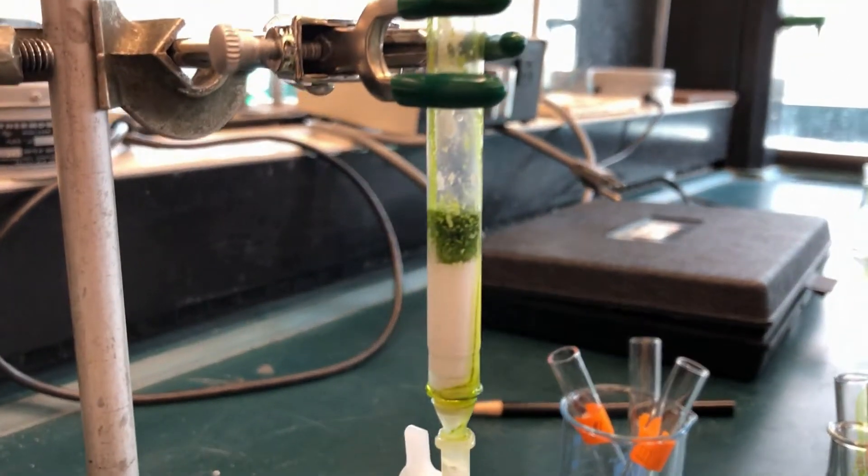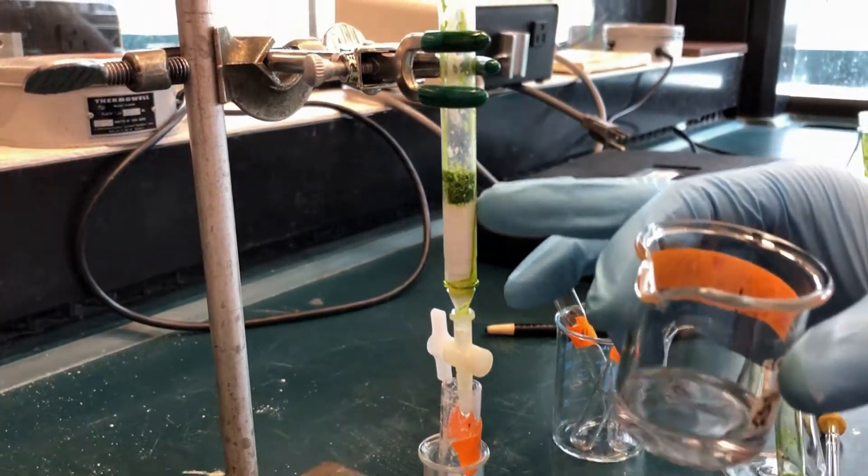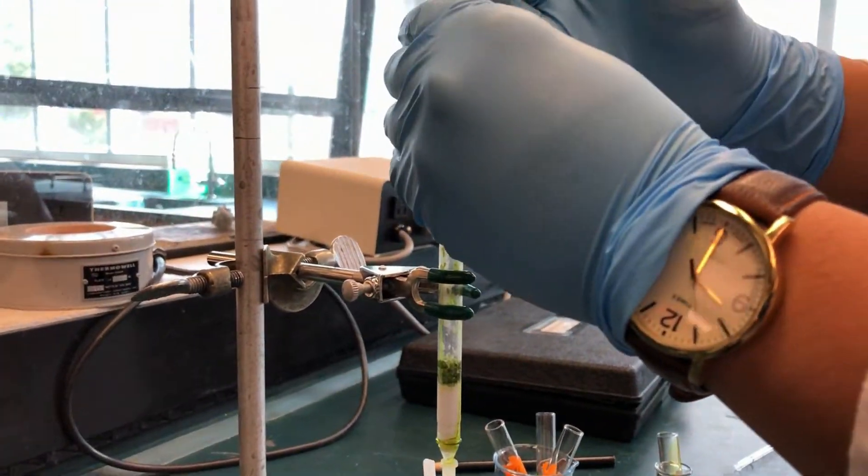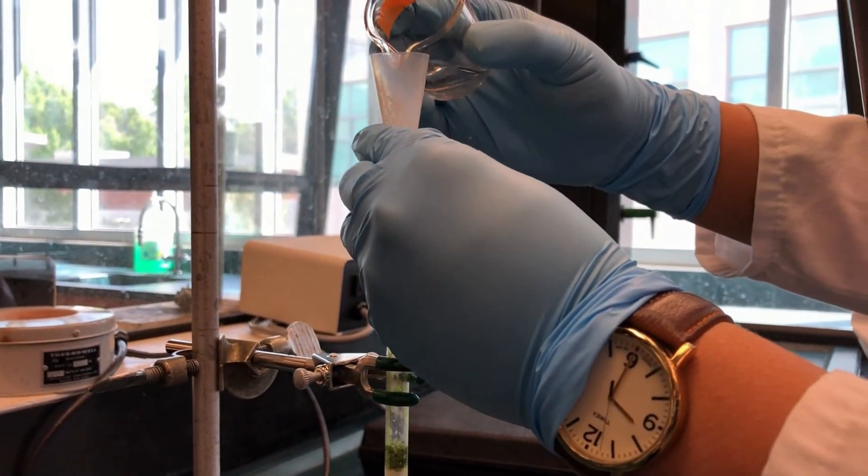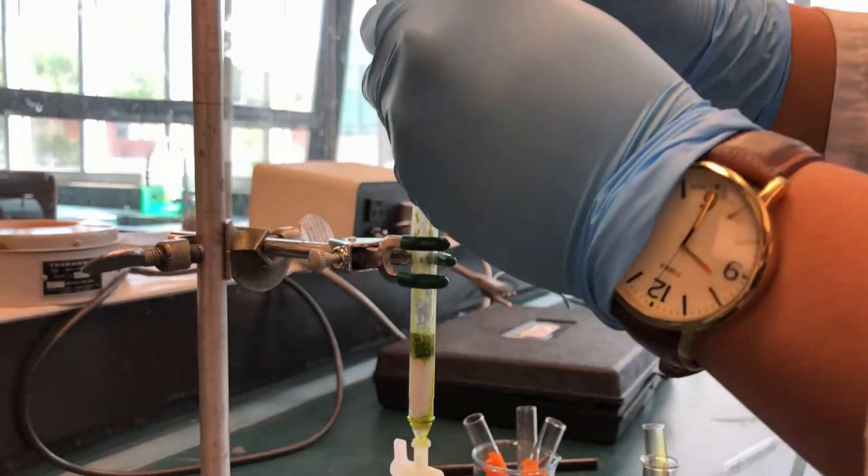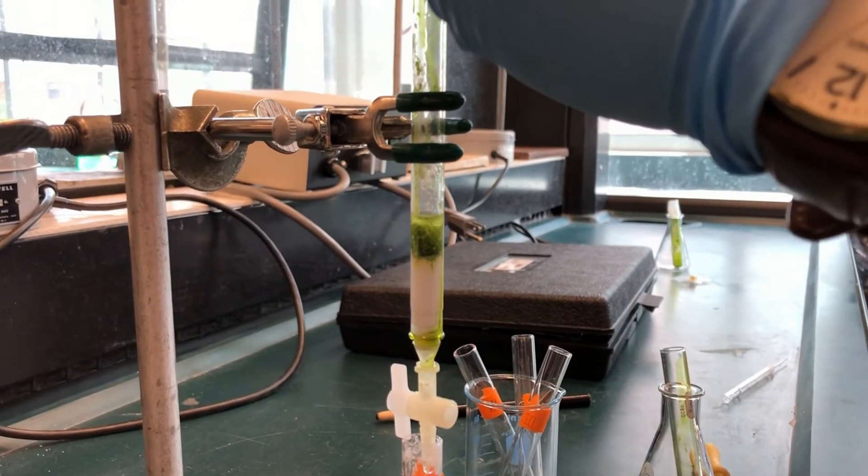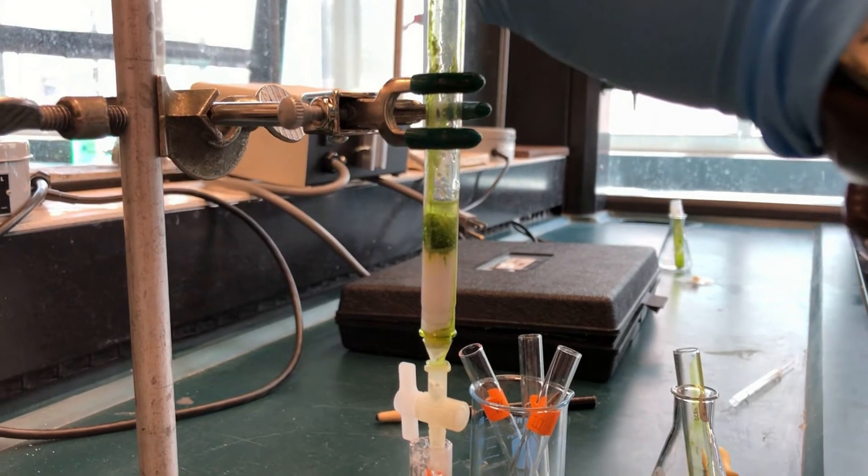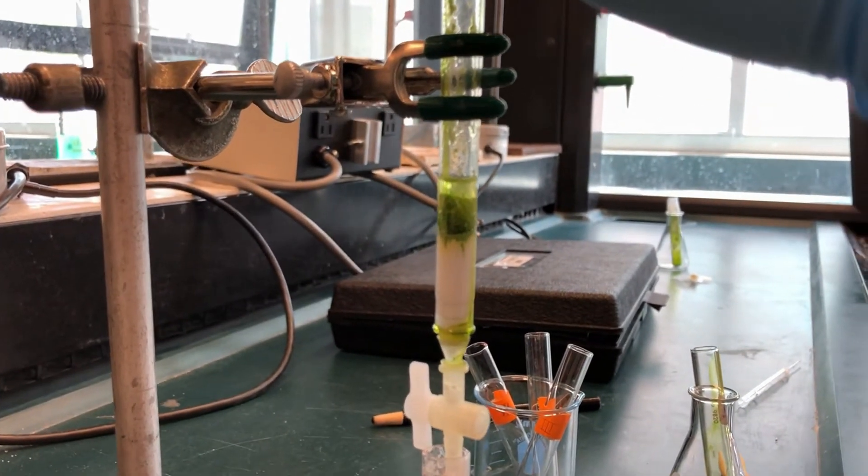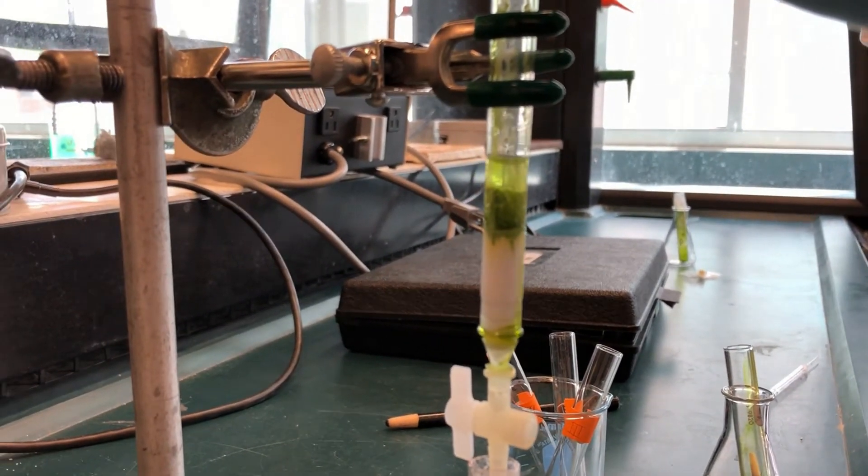Make sure the column does not get dry. Once the green solution has seeped into the alumina, add more petroleum ether. If the yellow band begins to separate from the green band, continue to add petroleum ether until the yellow band gets near the bottom of the column and then collect it in test tube 2.